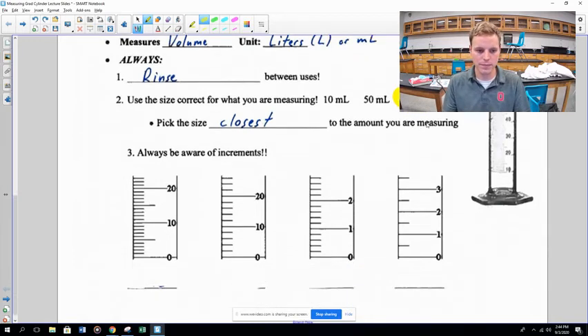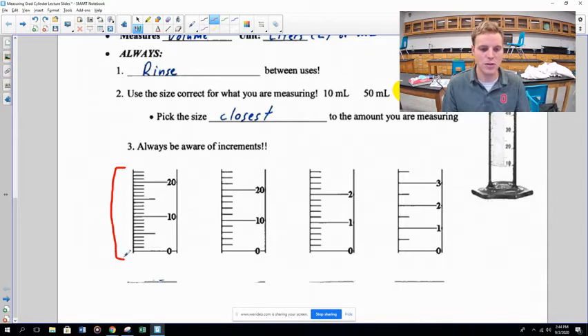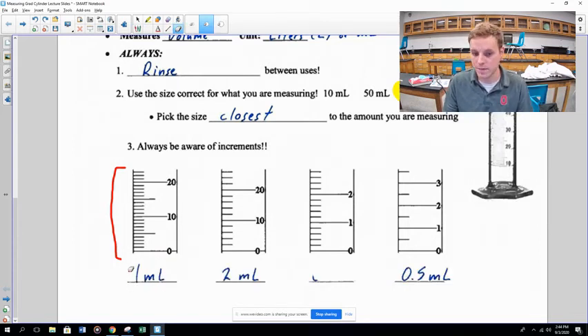You need to be aware of the increments — the little tick marks going down the side of the graduated cylinder — because they're not always the same size. For example, if there are 10 spaces between 0 and 10, each tick is 1 mL. If there are 5 spaces, each tick is 2 mL. If there are 5 spaces between 1 and 2, each tick is 0.2 mL. Always figure out what each tick mark represents before you read.